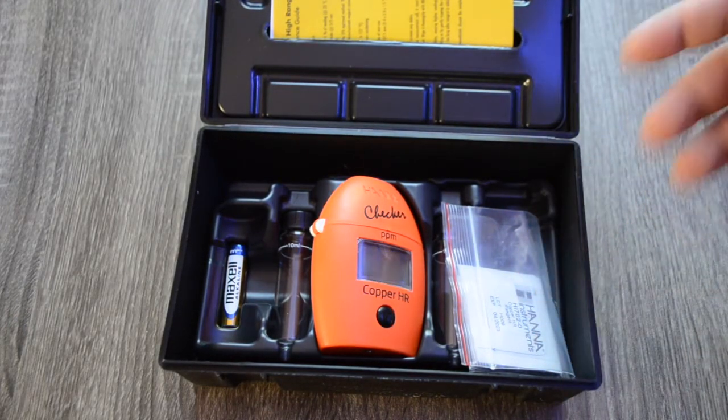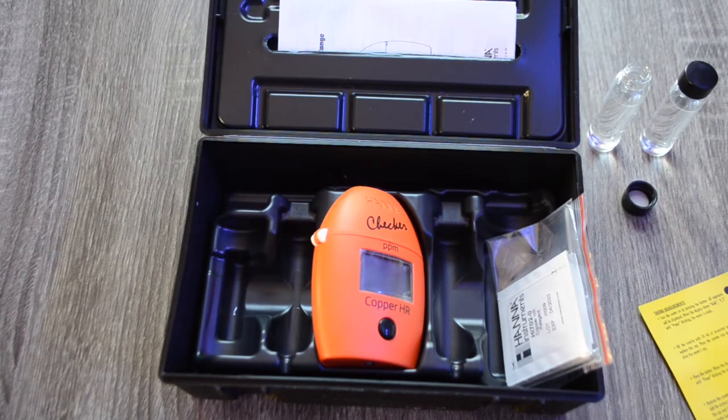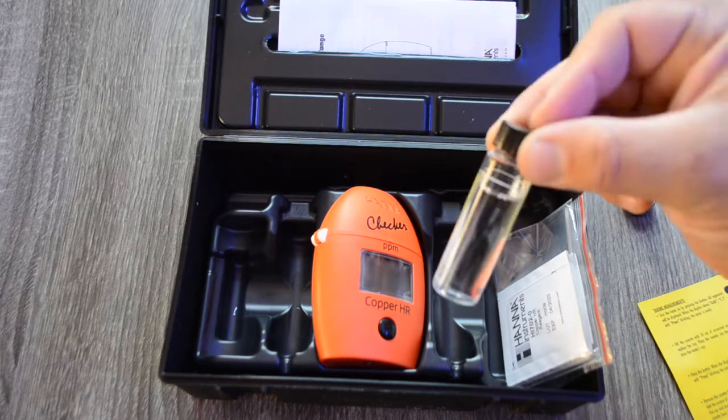We've installed the battery in the Hanna checker and also mixed up a little bit of copper treatment in some tank water. It's very important to make sure copper does not go into a reef tank because it can wreak havoc on inverts, corals, and all sorts of other critters. Anytime you're dosing copper to fish, it must be done in a separate aquarium and none of that equipment should ever go into your reef tank.